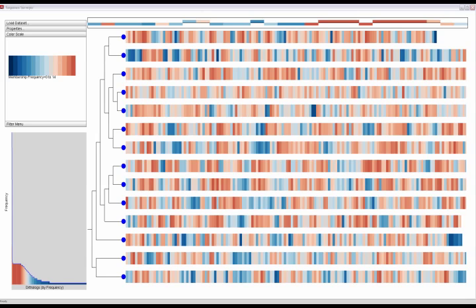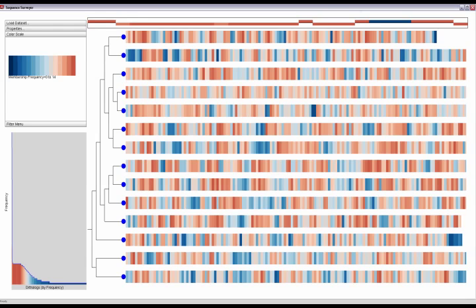Here, we apply Sequence Surveyor to a dataset of 14 plant pathogen bacteria. This view colors by membership frequency.